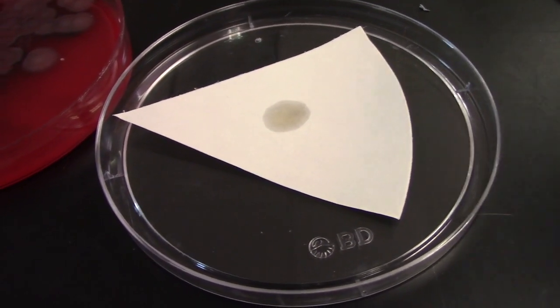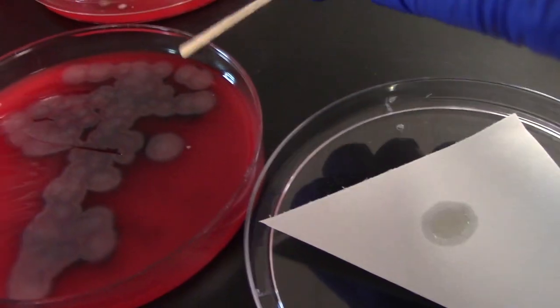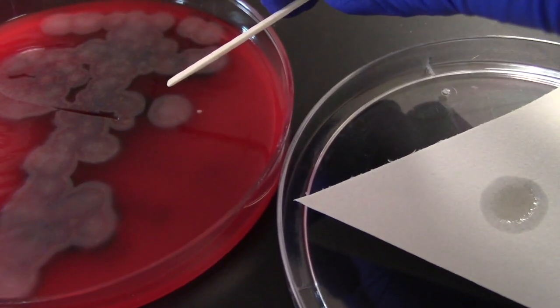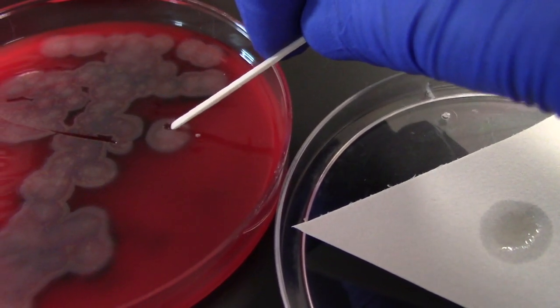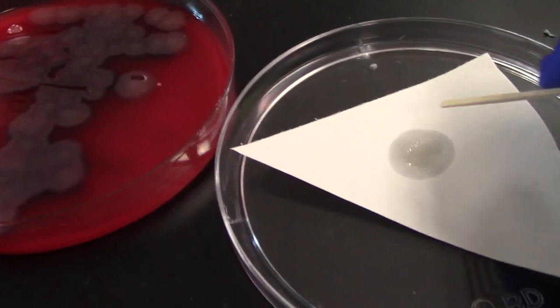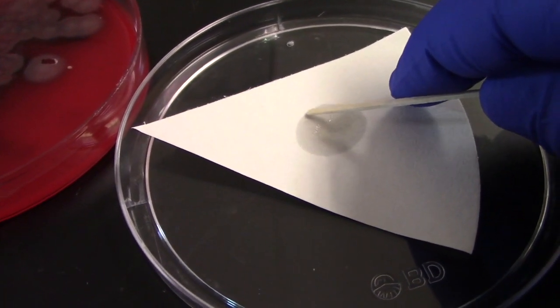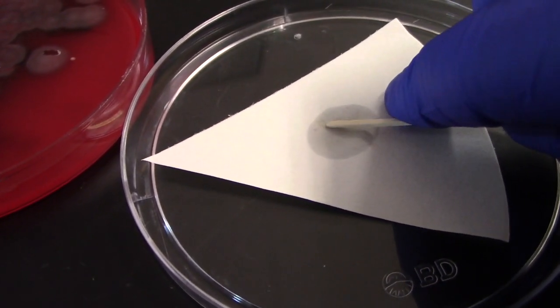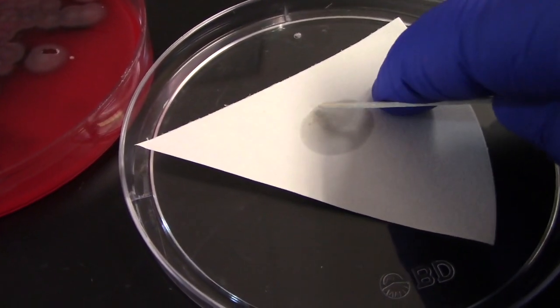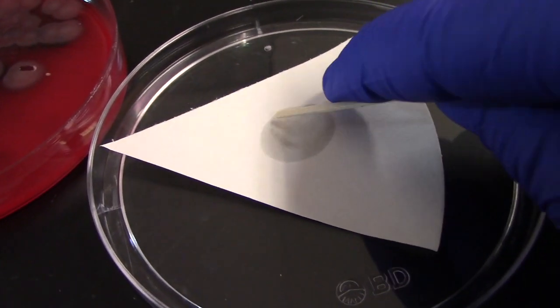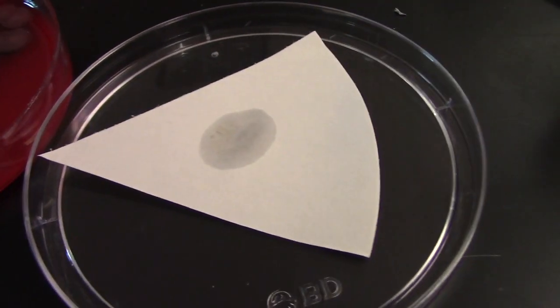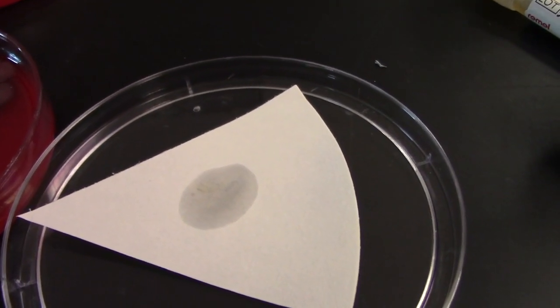We squeeze out a drop of the reagent onto a filter paper that's been placed inside the lid of our petri dish. Obtain a small amount of colony with a non-sterile stick and smear it onto the area where we've dropped the reagent.